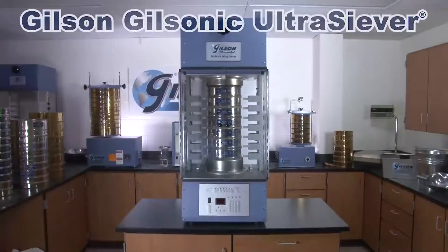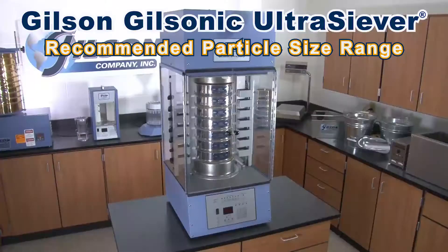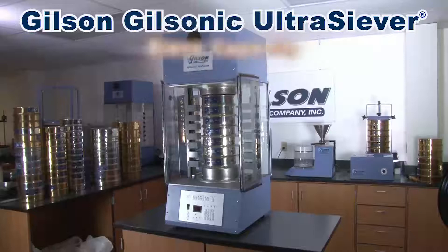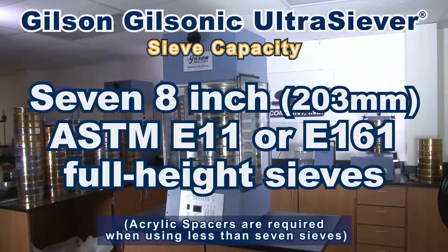With a recommended particle size range from a quarter of an inch to number 635 with woven wire sieves, or 150 microns to 5 microns with precision electroform sieves, the GA8 will hold up to 7 eight-inch full-height test sieves.